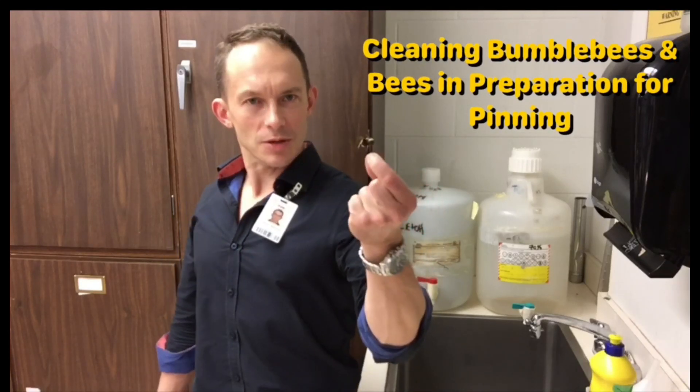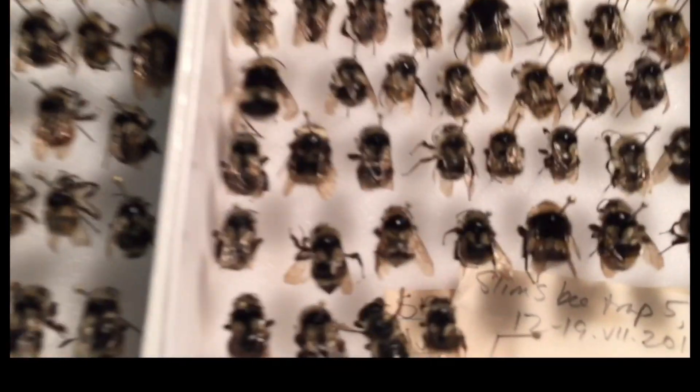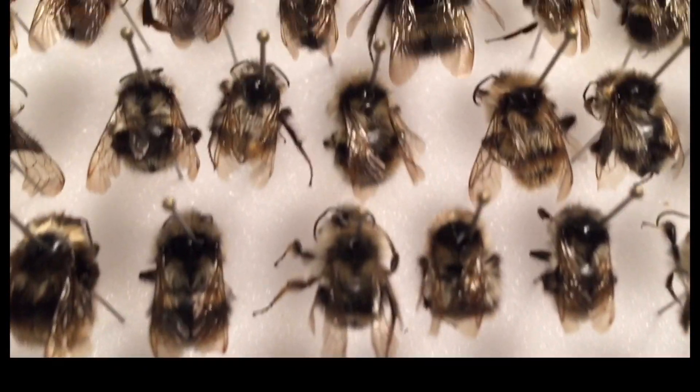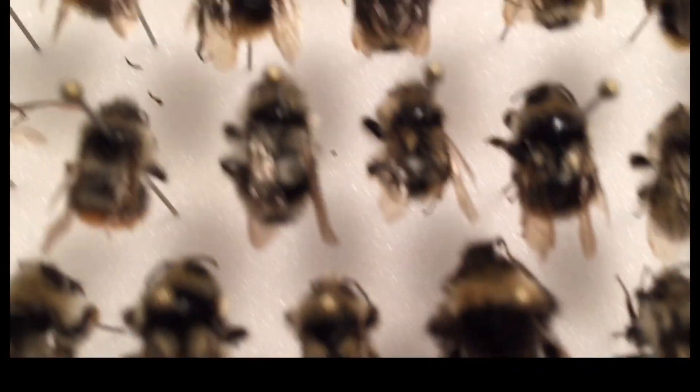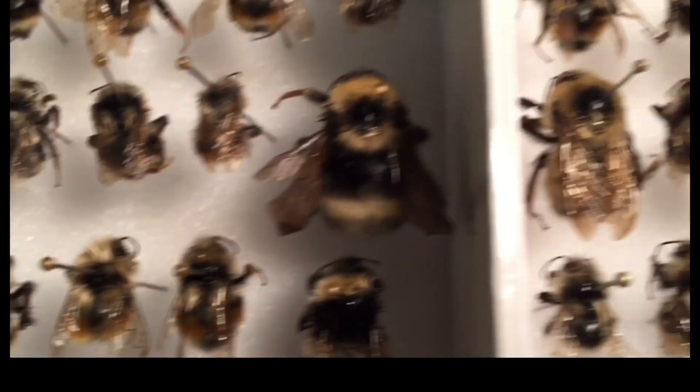In entomology you want your bumble bee specimens to look like this. When they're clean, all the hairs are visible and they're nice and fluffy, making them much easier to identify. The hair is not matted, it's nice and straight, and all the colors and markings are visible — making them much easier for identification for specialists.